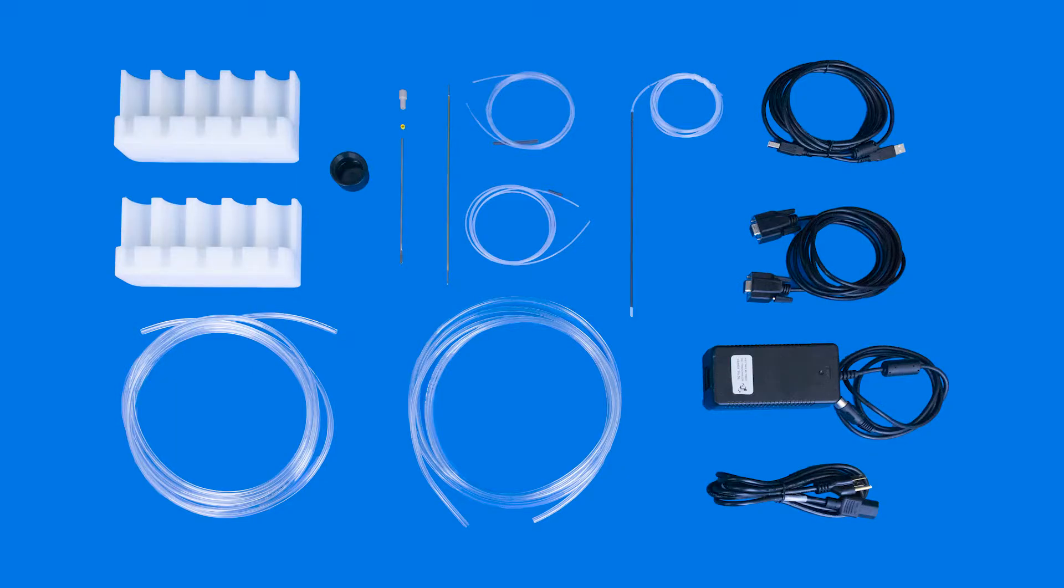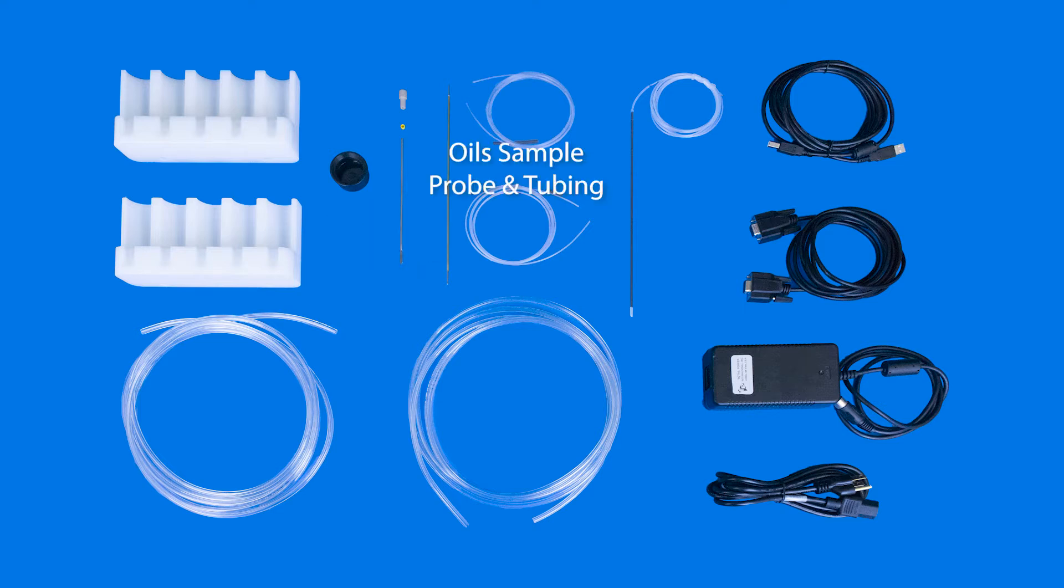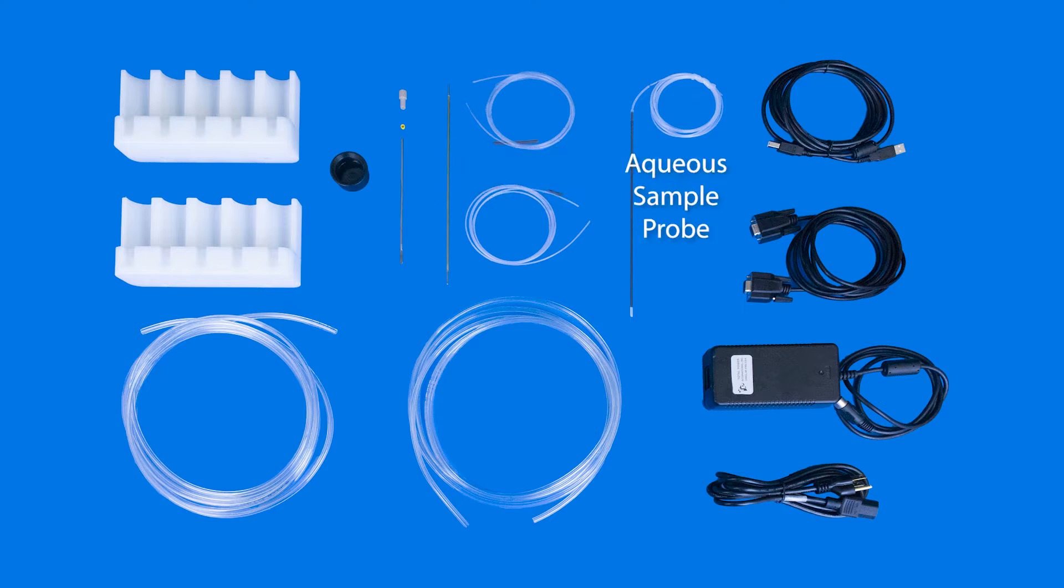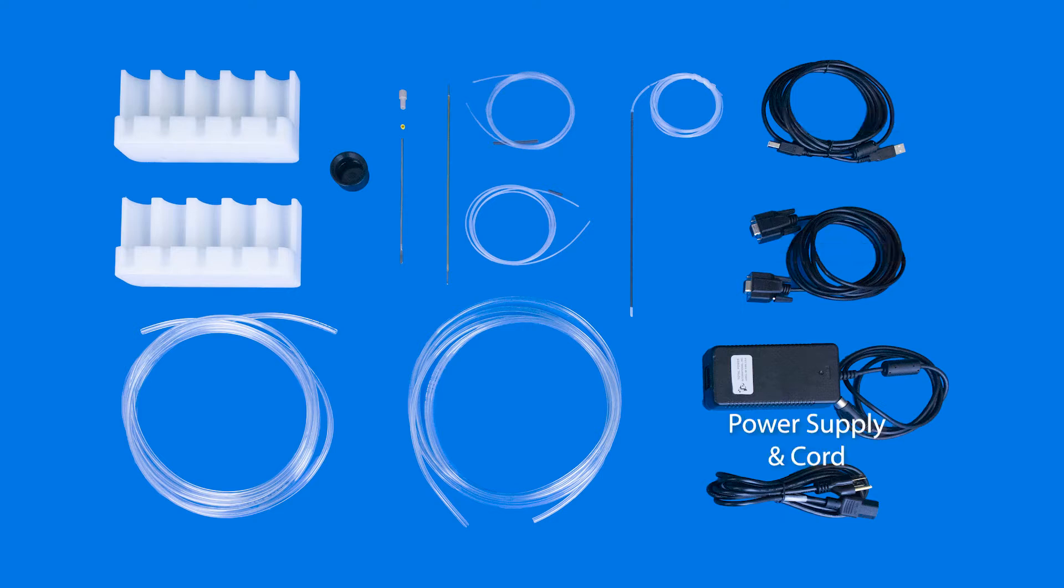You will be installing the standard racks, the drip cup, the stirrer paddle, either the OILS sample probe and tubing or the aqueous sample probe, rinse and waste tubing, a USB cable or serial cable, and the power supply end cord.